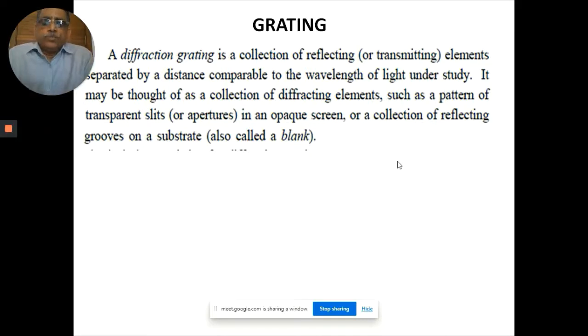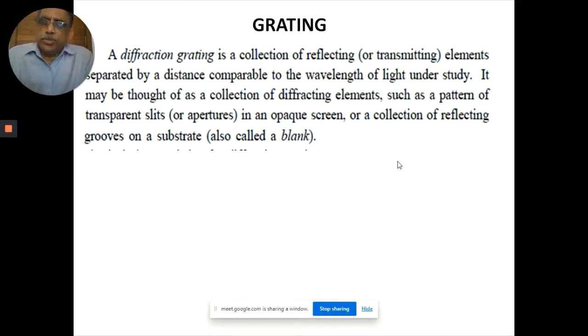So we have studied the prism. Prism is also one of the dispersion components, but prism has got its own limitation, whereas the grating is much more advantageous. Even before the gratings were invented, they were using prism based spectrometers, including Sir C.V. Raman, who used a prism based mono spectrometer only. So this is the interesting component, but now you can get a better resolution by using a grating. So grating had a great history also. You have to look at the history. I'm going to mention how they have evolved in the designing of the grating.